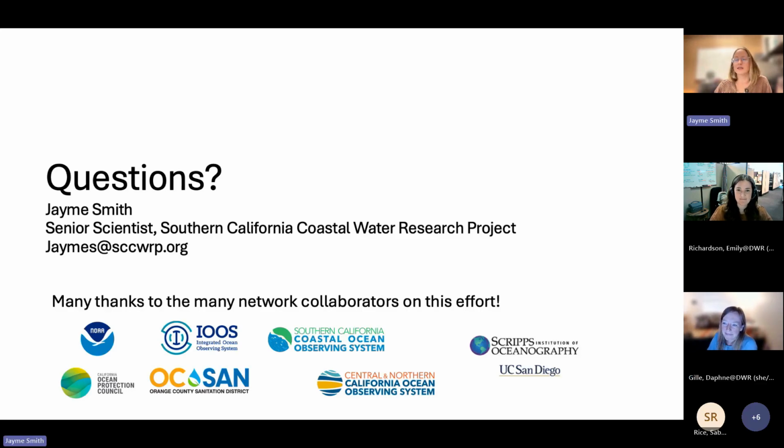Happy to give you what we've done on the marine end. We have one that we run in benchtop mode periodically, and you'd want to tune the instrument to how dense your sample is. Marine people say it's the densest bloom, and I'm like, have you ever been to Clear Lake?